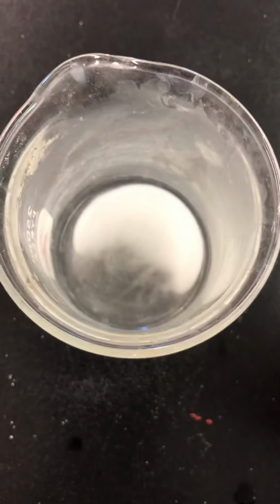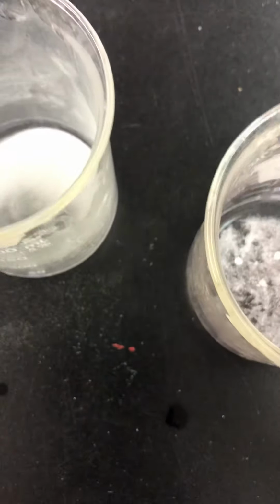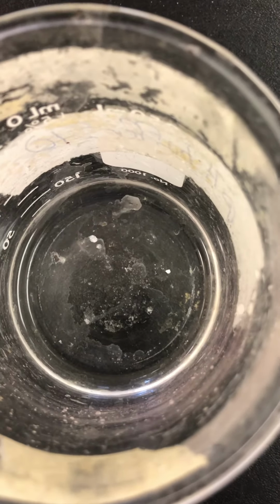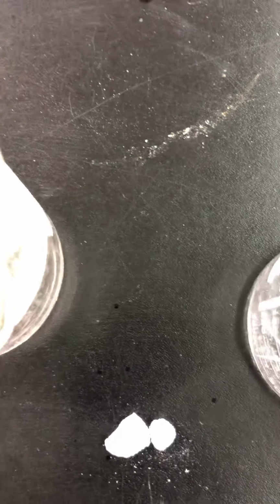I'm just going to remove those chunks. Give me a moment. Okay, here we go. Okay. Okay, so that was solid 3. Here is solid 4.